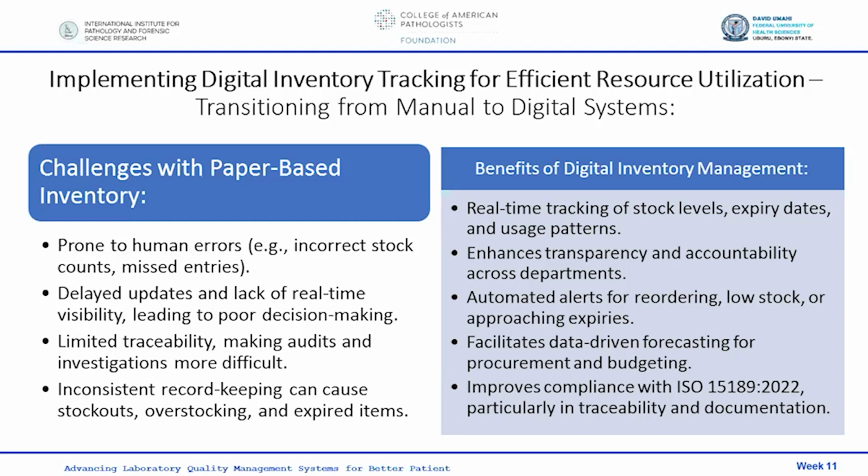It enhances transparency and accountability across the departments. Automated alerts, like I've mentioned before, for reordering, low stock, or approaching expiries are available in the digital inventory management system. It also facilitates data-driven forecasting for procurement and budgeting. Since you're seeing everything in real time, it is data-driven.